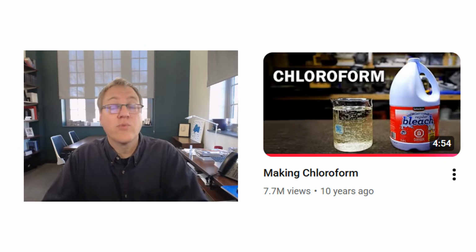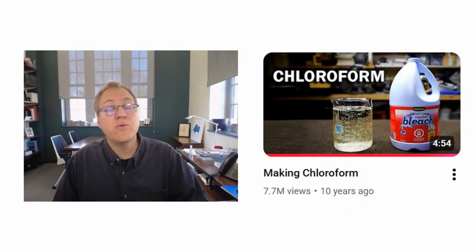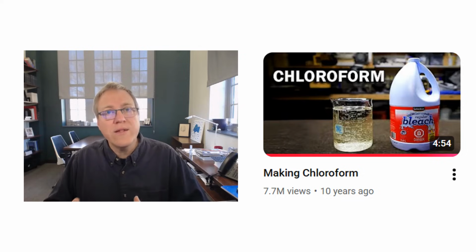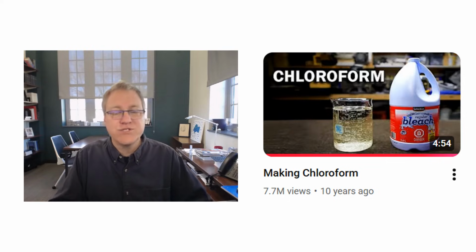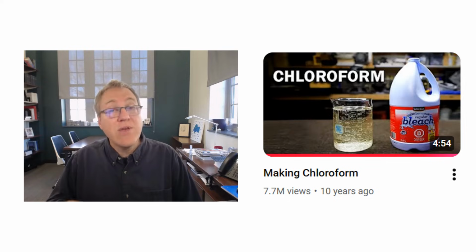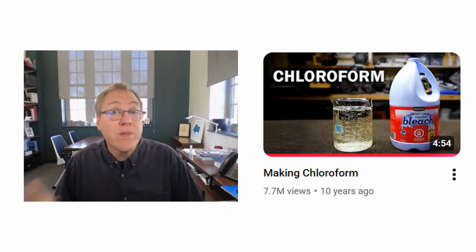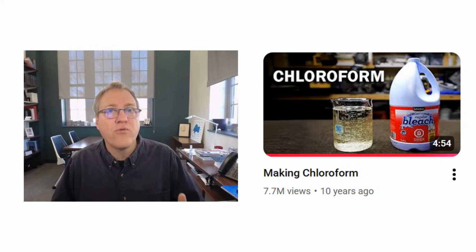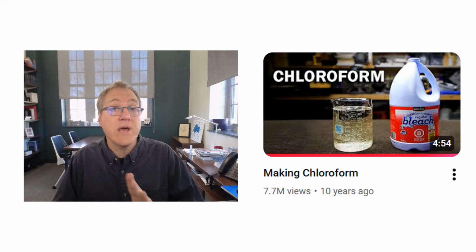This is yet another reaction video. Again, I'm going to react to an old NileRed video. When I say old NileRed video, it's 10 years old. He has some great old content that's just straight up organic chemistry. If you haven't looked at older parts of his catalog, please do. This particular video has NileRed making chloroform from just acetone and bleach.